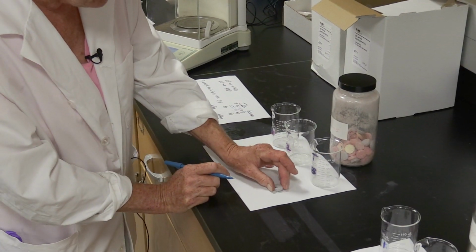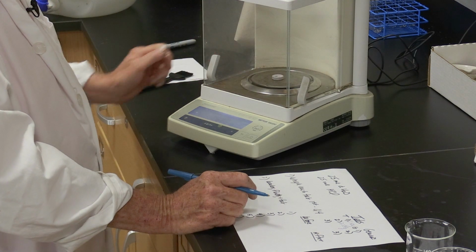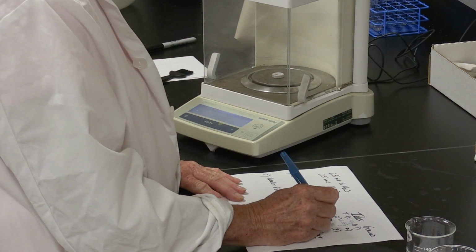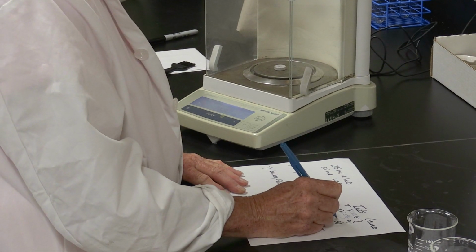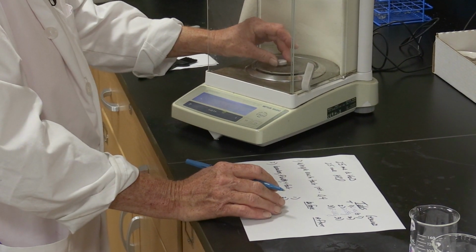And Tums 3 tablet weighs 2.680 grams. All right, done with the Tums.